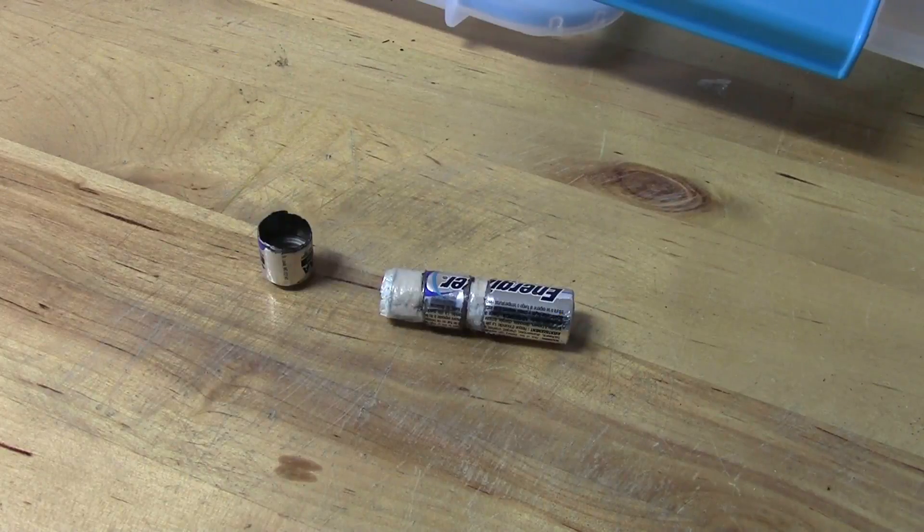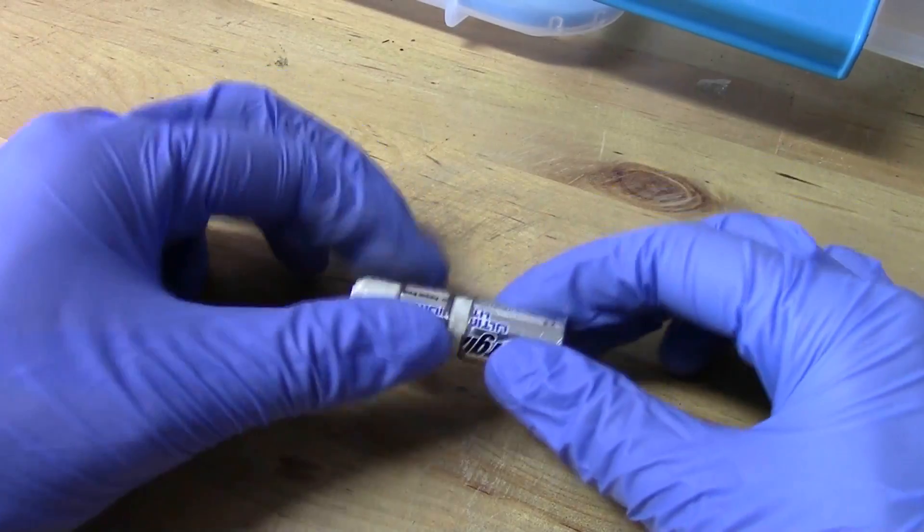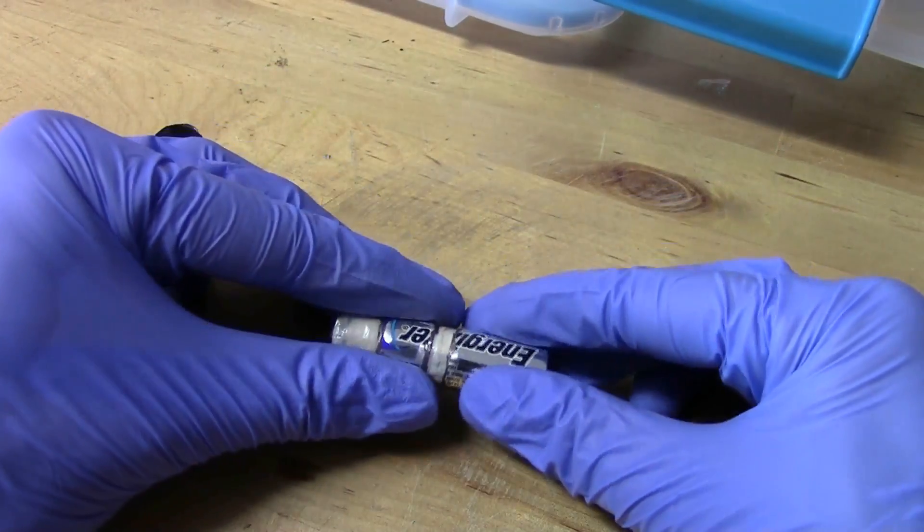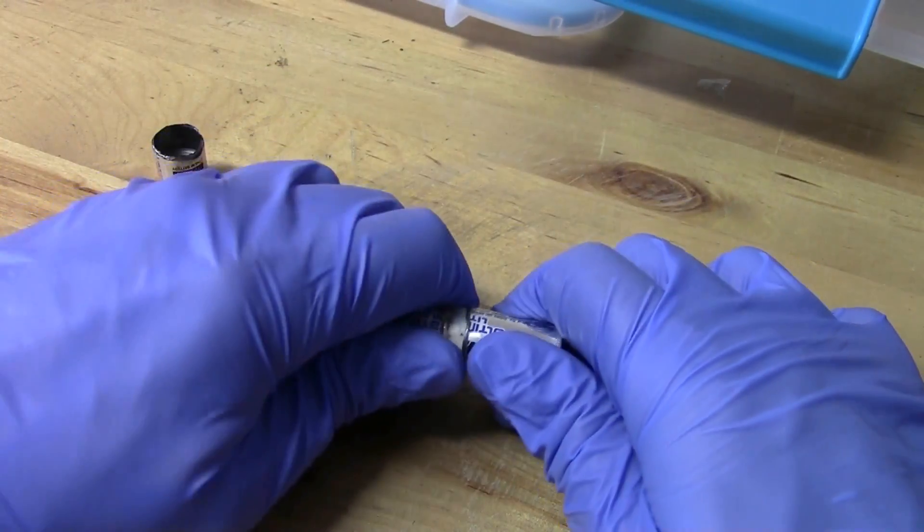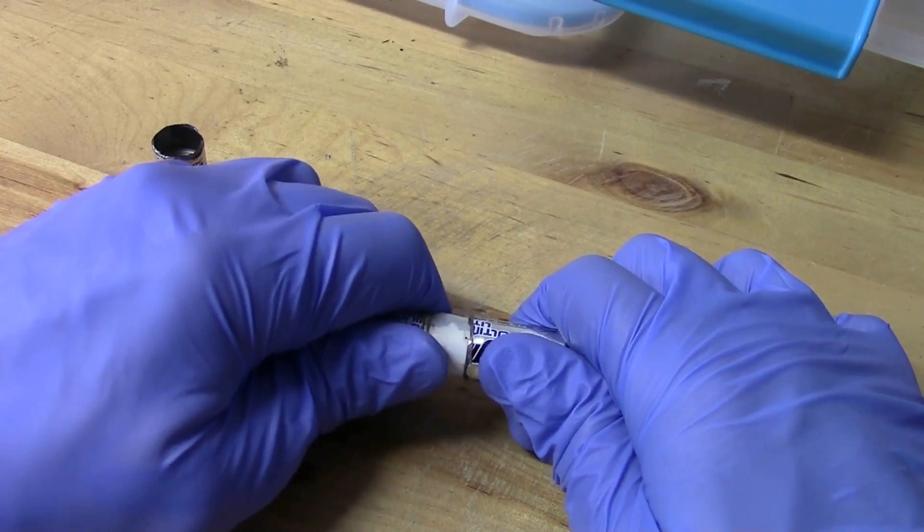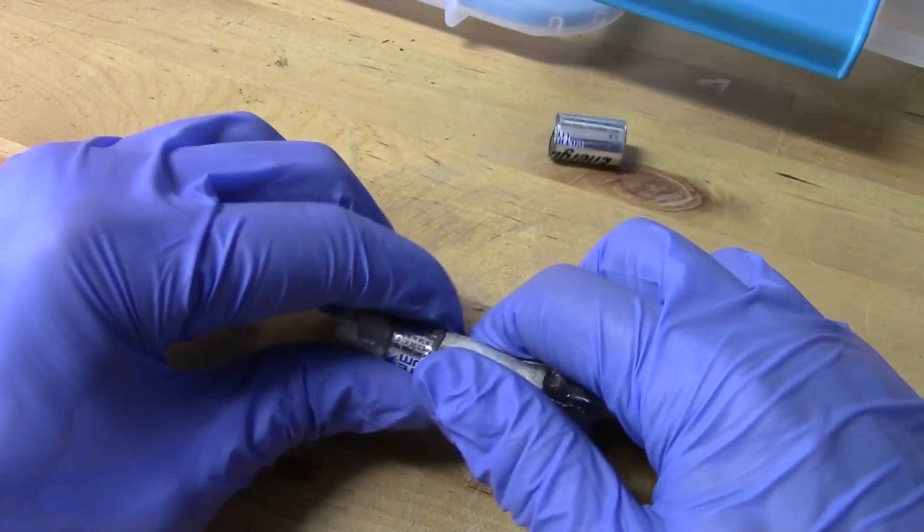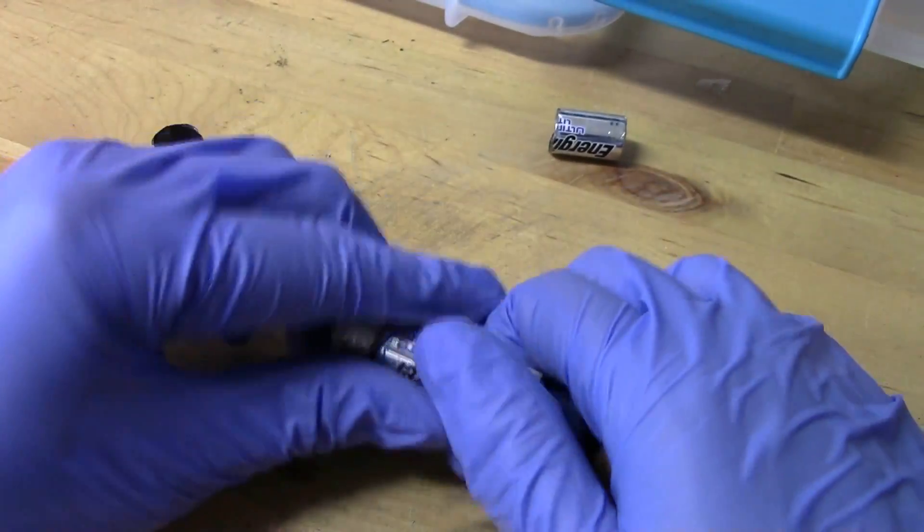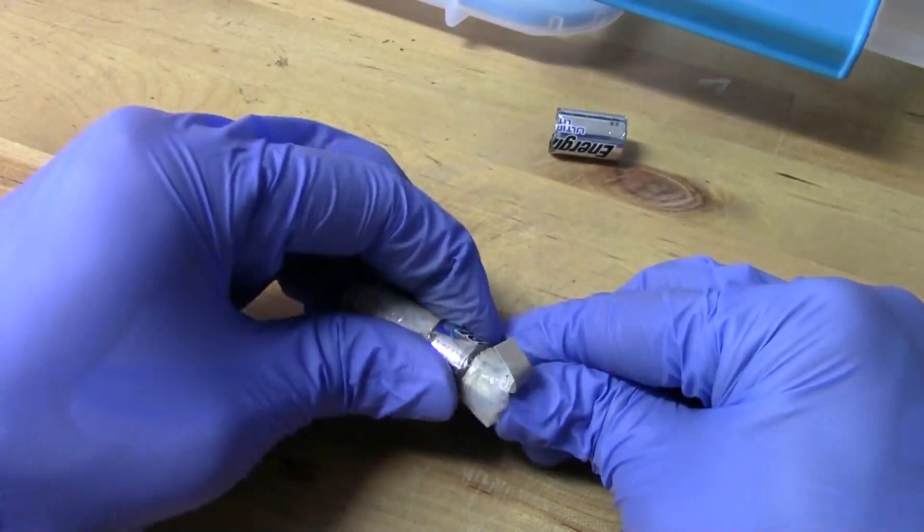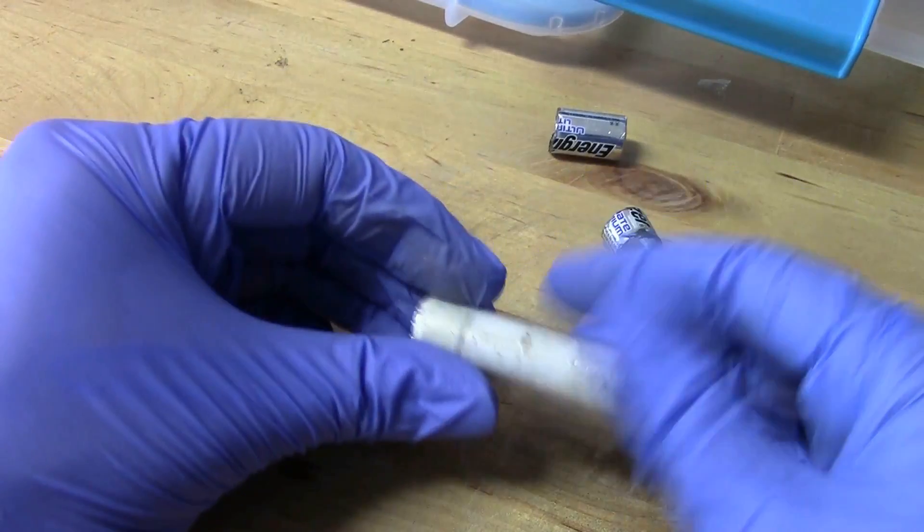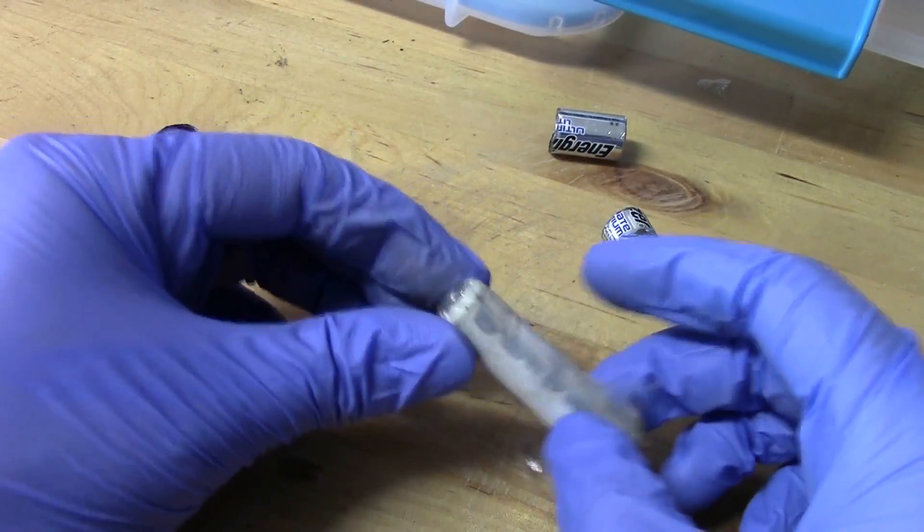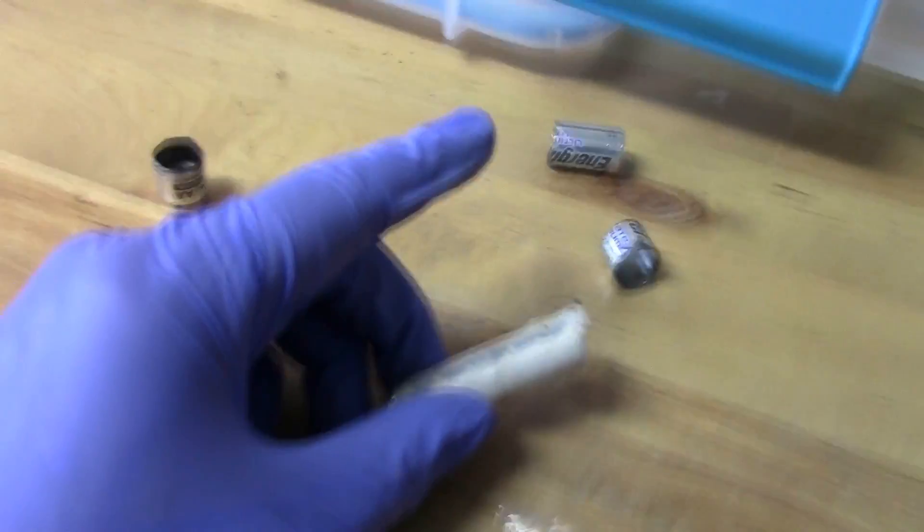So even after getting the cap off I still had some trouble getting the thing out so I did the same thing and cut another ring out and now it should come out pretty easily. Awesome. I'll just slide this ring off. Okay great great so this is the core of the battery and now this is going to go into my glove box here and we'll fill it up with argon and then take it apart in there.